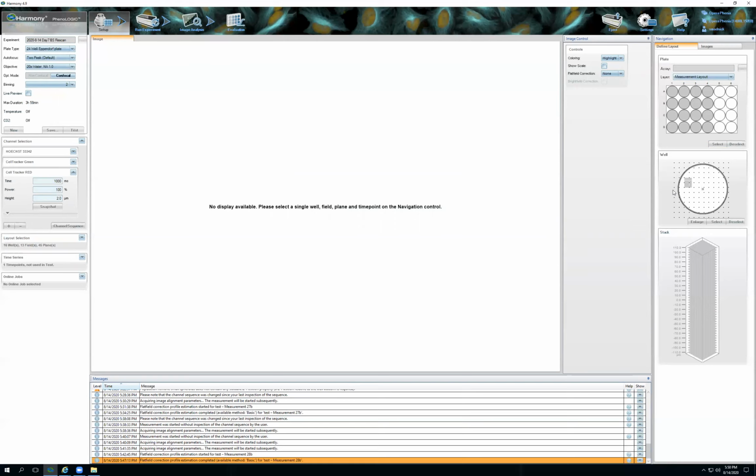13 fields, how long it's going to take. So I think I was aiming for closer to 25. So for me, mine's going to take a little bit longer. Right now, you can always image more versus less, but you have an idea of how long it's going to take. And how many you select here doesn't matter, but do you want to proceed? No, because I forgot to save this. So I'm going to go here. I'm going to save my rescan. I'm just going to put it on my run.